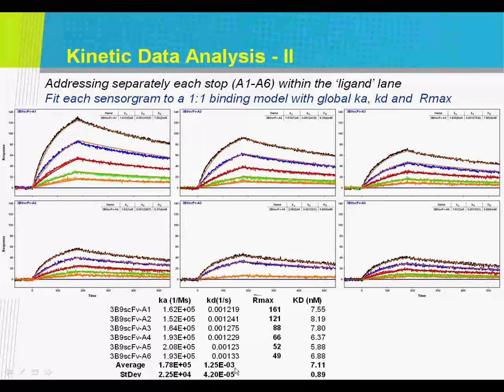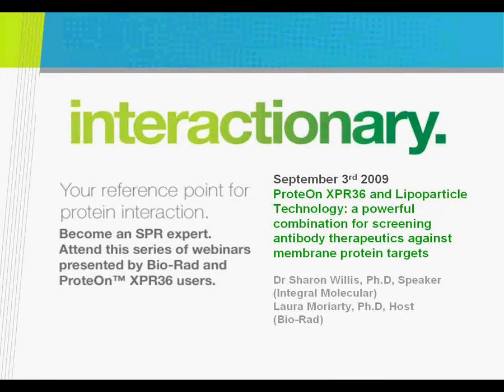In our case, most of these were just a proof of principle, and how they fit, like in the case of those shark domains. He was really interested in being able to affinity mature some of these and to find out how they bind to AMA1 proteins. So some of these proteins were then taken and made as the V domain on its own and put into crystallization trials. He wanted to understand how they bind to the target protein, so he was really trying to understand the protein-protein interaction at a crystallography level.